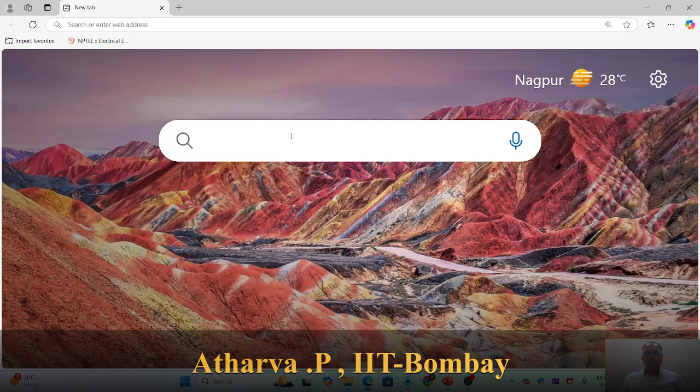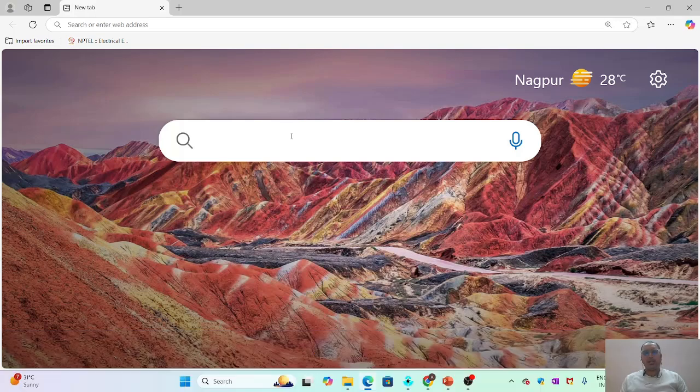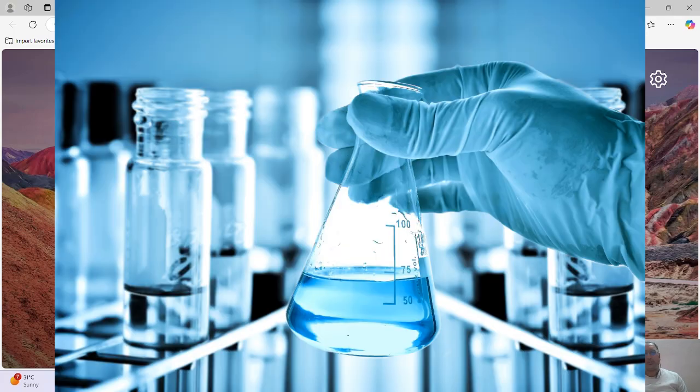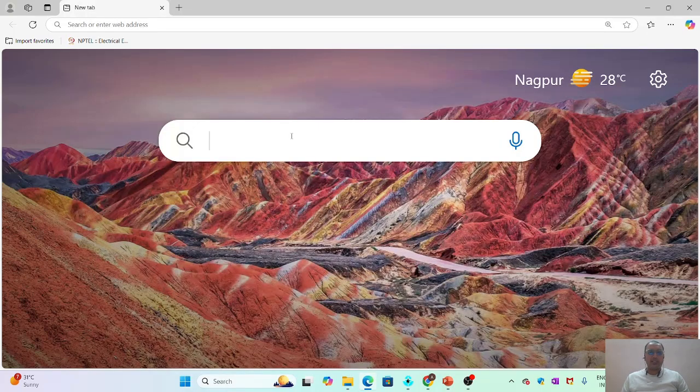Today, we are going to see a very interesting open source tool which can be used to actually simulate a whole chemistry lab. Yes, you heard it right. You might have seen industries and even institutions, they have huge chemical laboratory setups in which there are so many equipments, glasswares, chemicals, there are acid bases, and you perform certain experiments on that. Now, it's not possible in everyday life to have such kind of a facility. So how to do that sitting on your laptop, and that absolutely for free.